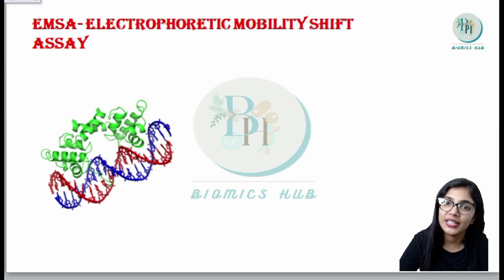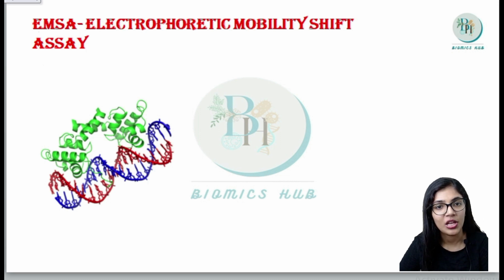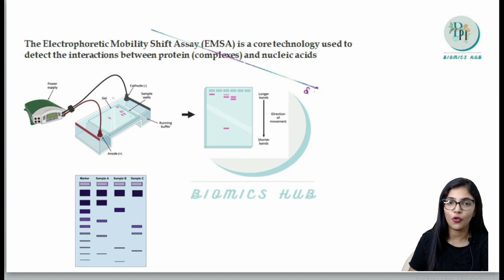Today in this video we will be discussing one of the techniques, that is EMSA. It is also known as electrophoretic mobility shift assay. By using this technique we can study the interaction between protein and DNA. Before that, we have to be very clear about gel electrophoresis.